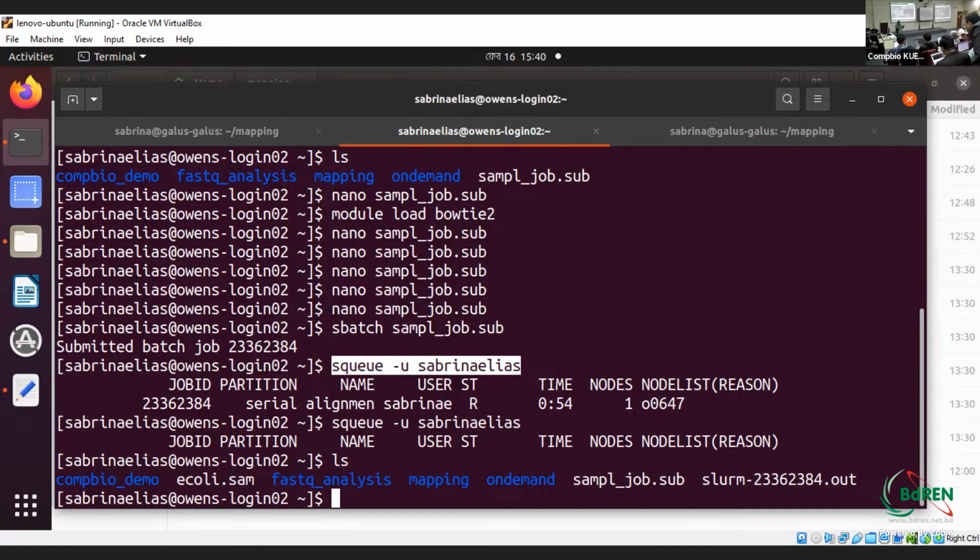So just check in your computer if you got this file also in your HPC login. In addition, there is another file, slurm out. It is showing, I mean, if there was any error, it will show that, and the progress.